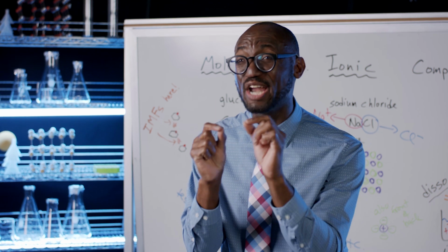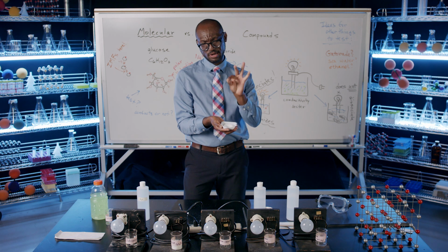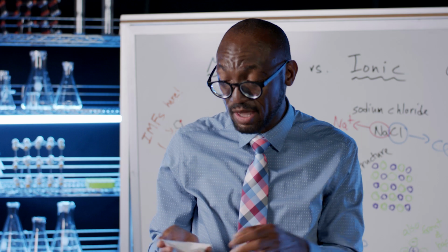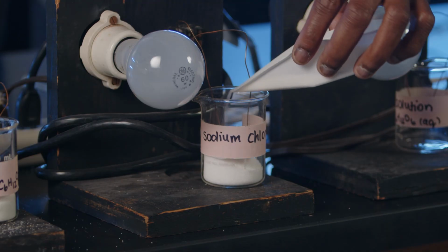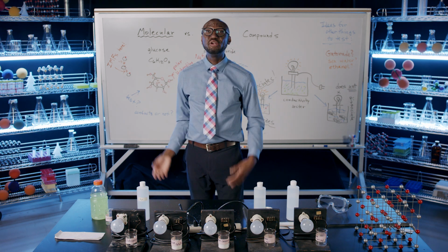So let's try something else. Let's try something ionic. Maybe we'll get a different result. So everybody knows table salt. I have some, sodium chloride here. I use way too much in my cooking. It is made up of sodium cations and chloride anions, and I'm gonna put some into this beaker. So I've put the electrodes in the beaker of sodium chloride, turn the lights on, and once again, nothing happens.